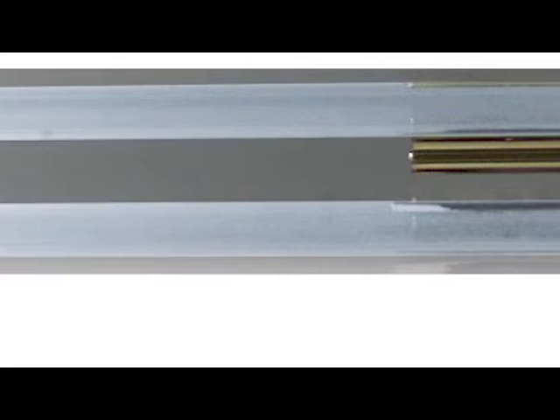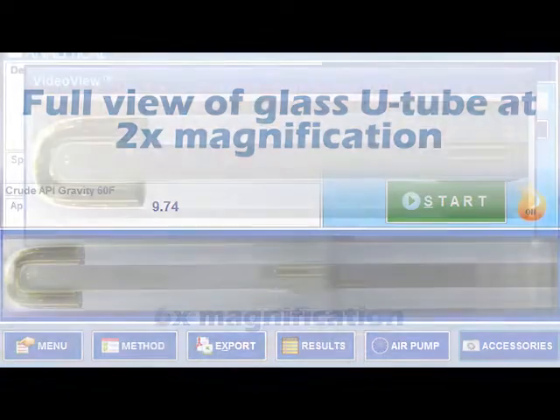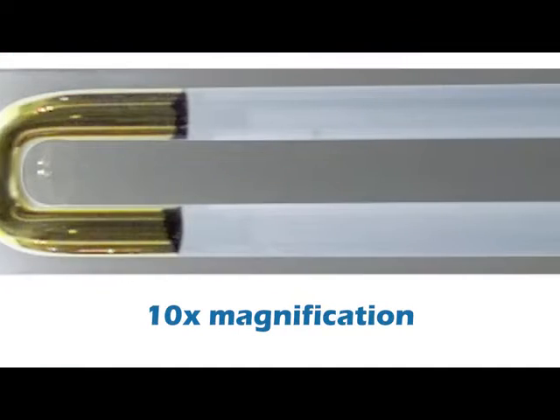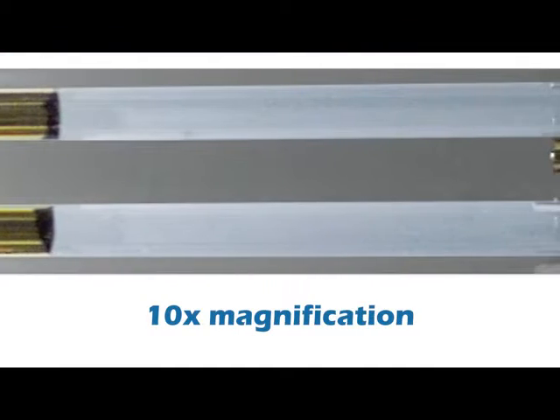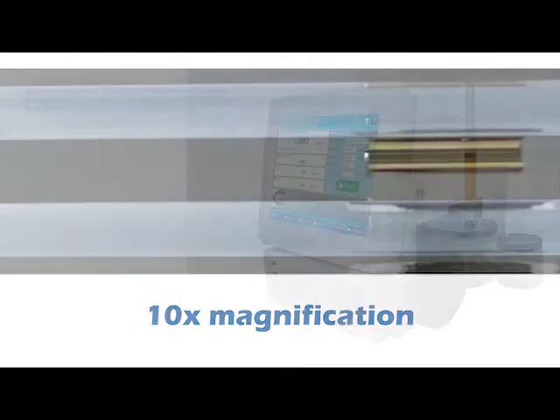Rudolph density meters offer a new high-resolution camera for even sharper image quality. A full and clear view of the entire U-tube is possible at two times magnification so you can see any potentially error-causing bubbles. The U-tube can also be viewed at six times magnification and ten times magnification, then scanned back and forth so the entire U-tube is visible.